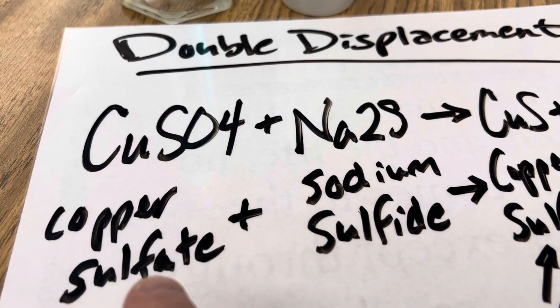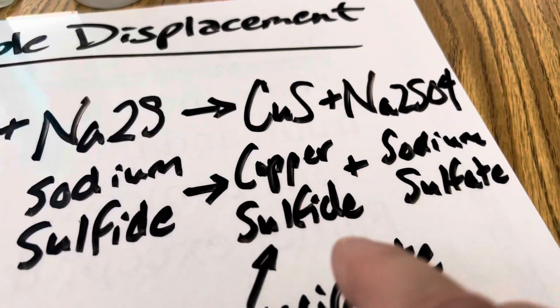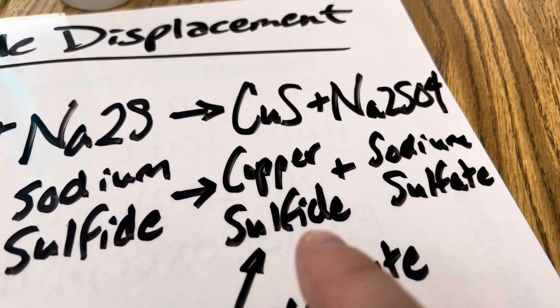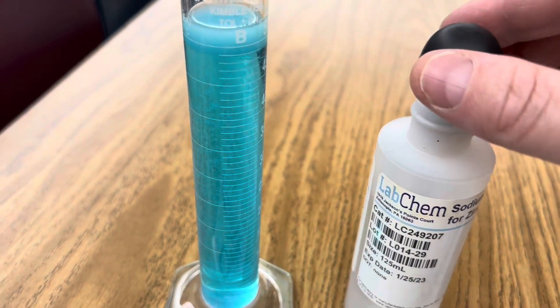These are your reactants: copper sulfate and sodium sulfide. They'll change into copper sulfide and sodium sulfate, where copper sulfide is the precipitant that's very dark and insoluble.